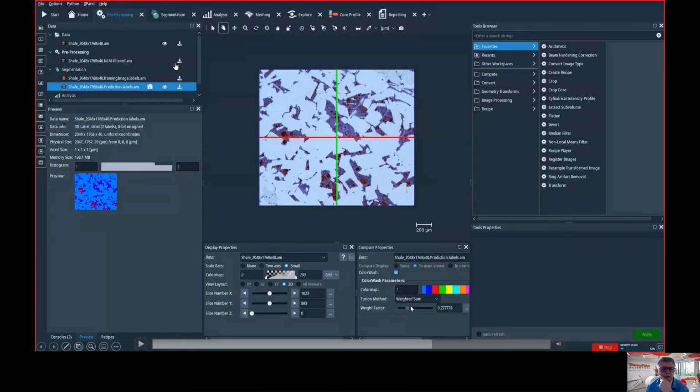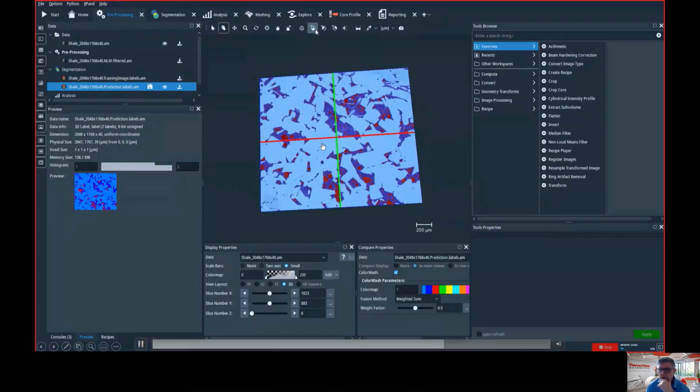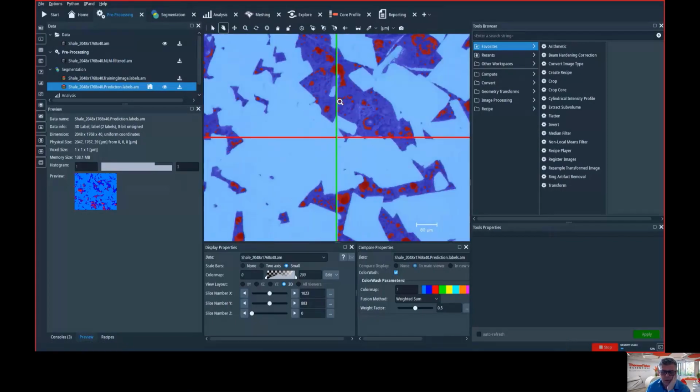So this is PerGeos, but in Avizo you will be able to have your own workflow. And at a certain point you stop, you have one of the blocks, it's your own custom Python code with your own capability of doing segmentation. So you will be able to automate the workflow, to repeat it with many other data sets. So if you integrate your own code, then you will use the facilities of Avizo. So you will really speed up the way you work.